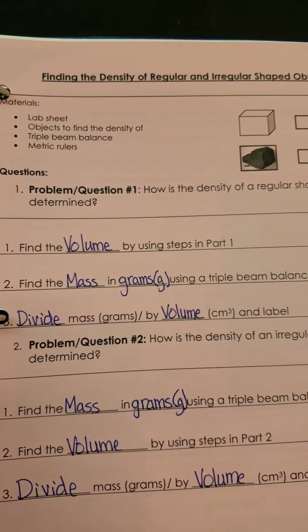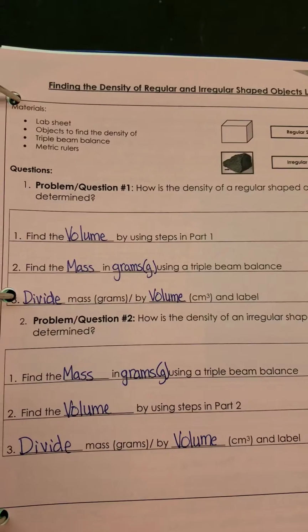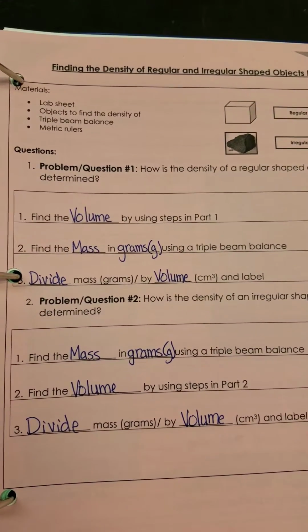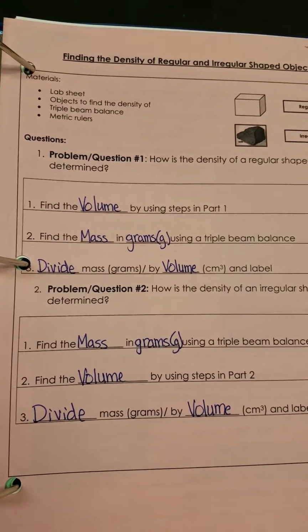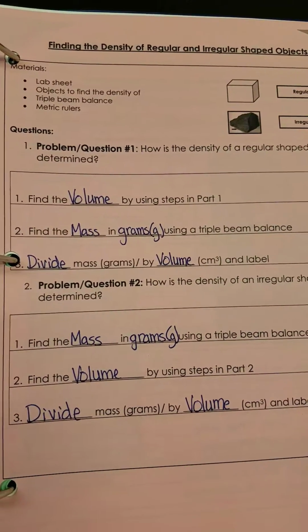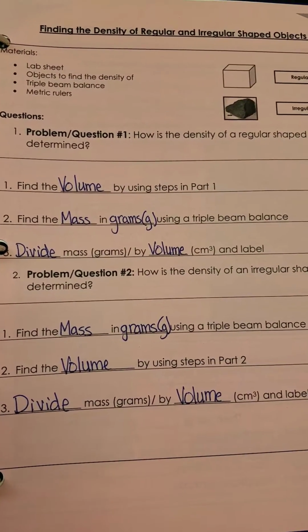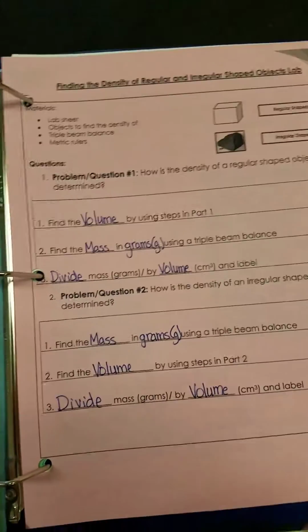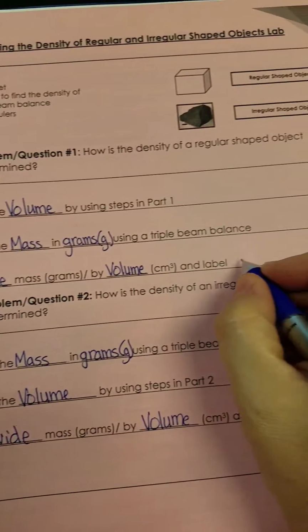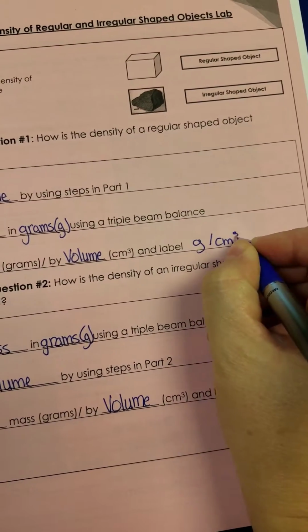For question 1, how is the density of a regular shaped object determined? Number 1, you find the volume by using the steps in part 1. It's on the next page, you'll see that there. Number 2, find the mass in grams using a triple beam balance. And 3, divide the mass by the volume and label your answer in grams per cubic centimeter.